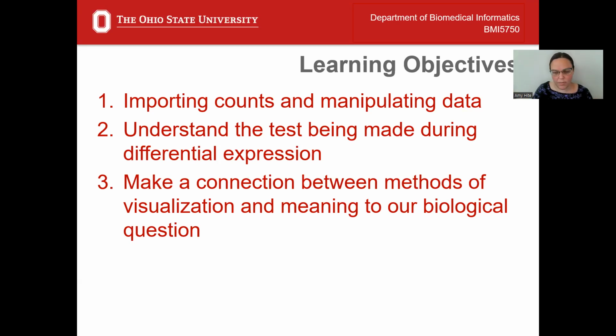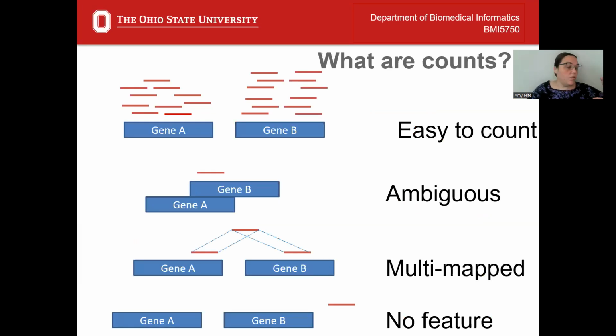And then we're going to talk about functional enrichment analysis. Can we take what we found in differential expression and ascribe some biological meaning to that? Okay. So we're doing things a little bit backwards here. We're starting with some publicly available data that's already been analyzed down to the point of counts.